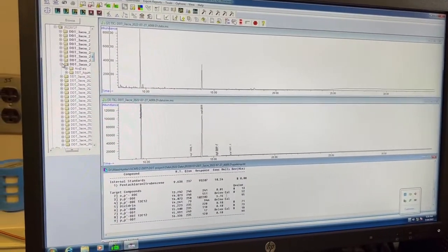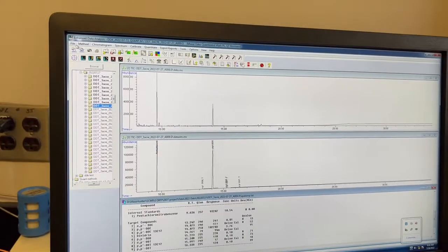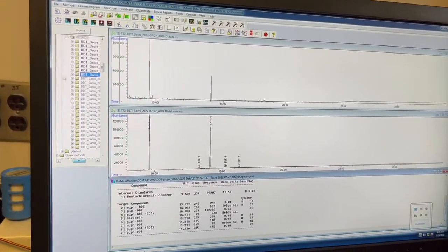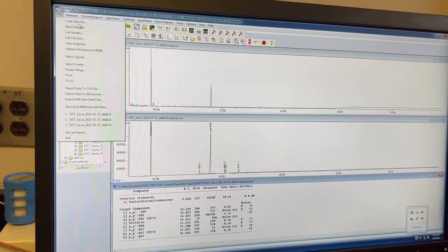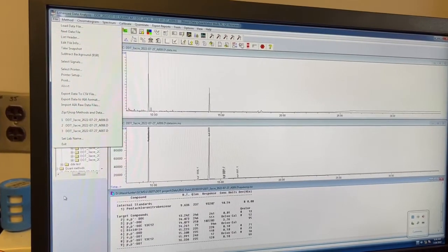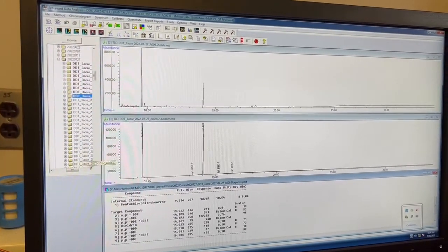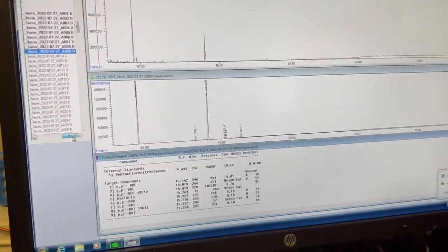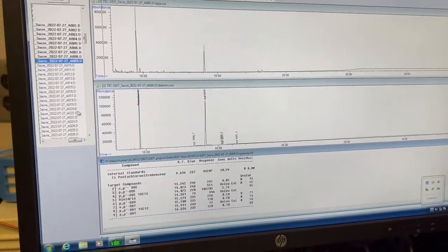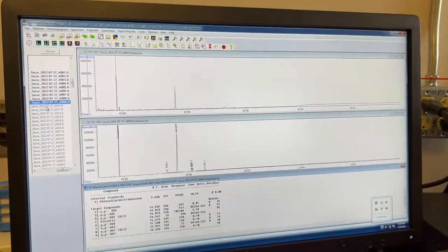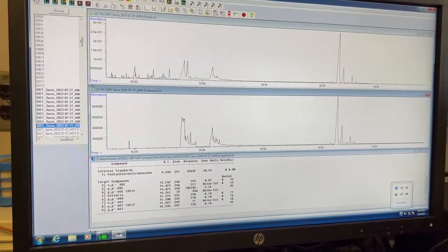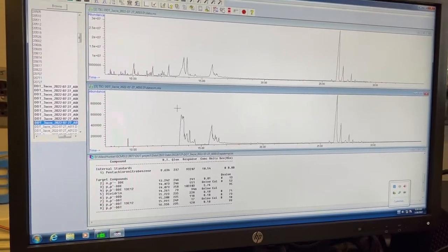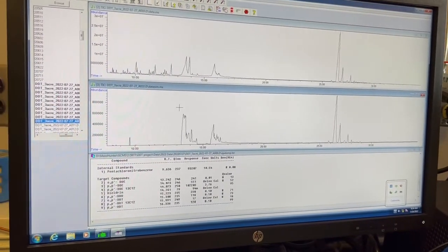And so now we can just go to the next one. And again, if you don't like scrolling through this thing, you can go to File, Next Data File. So I prefer to scroll through this. I prefer to do Load File. But it depends on your personal preference. So we'll go to the next one. And this is our first sample. So this is a worm sample.